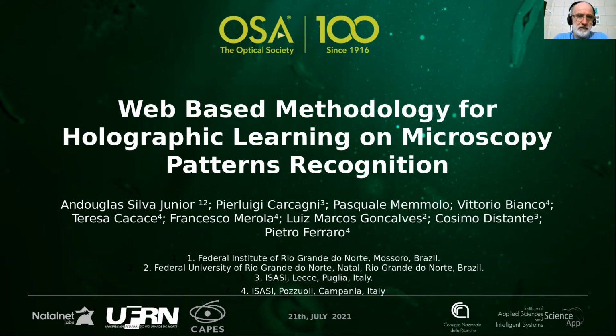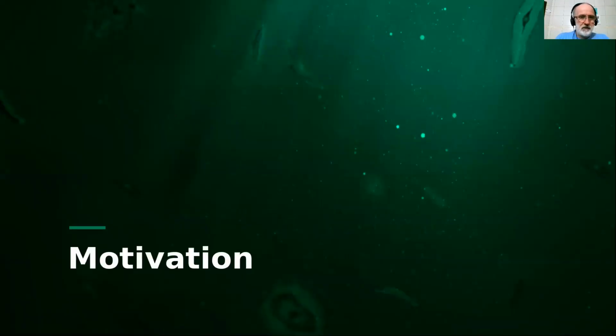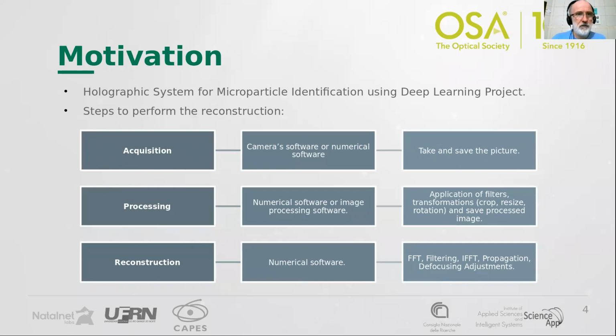So our idea is to construct a web-based application for holographic learning. This is the outline of my presentation, and basically I start with the motivation that we faced at the beginning of the work, that is to have a holographic system for microparticle identification using deep learning.